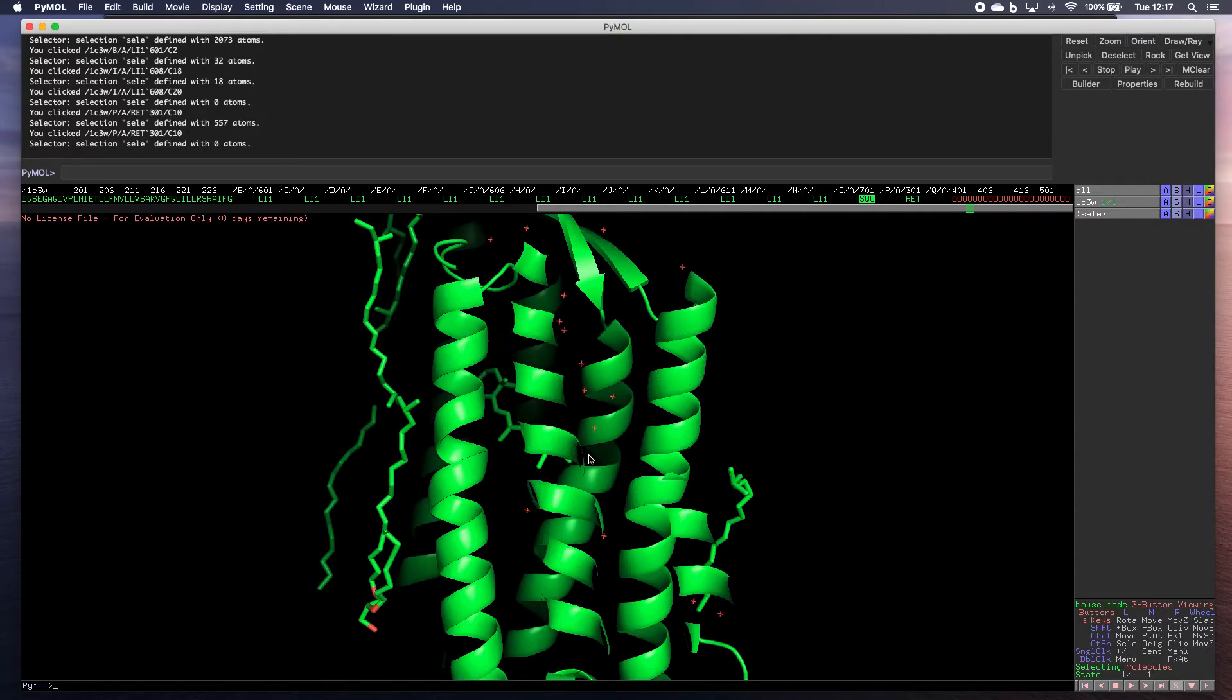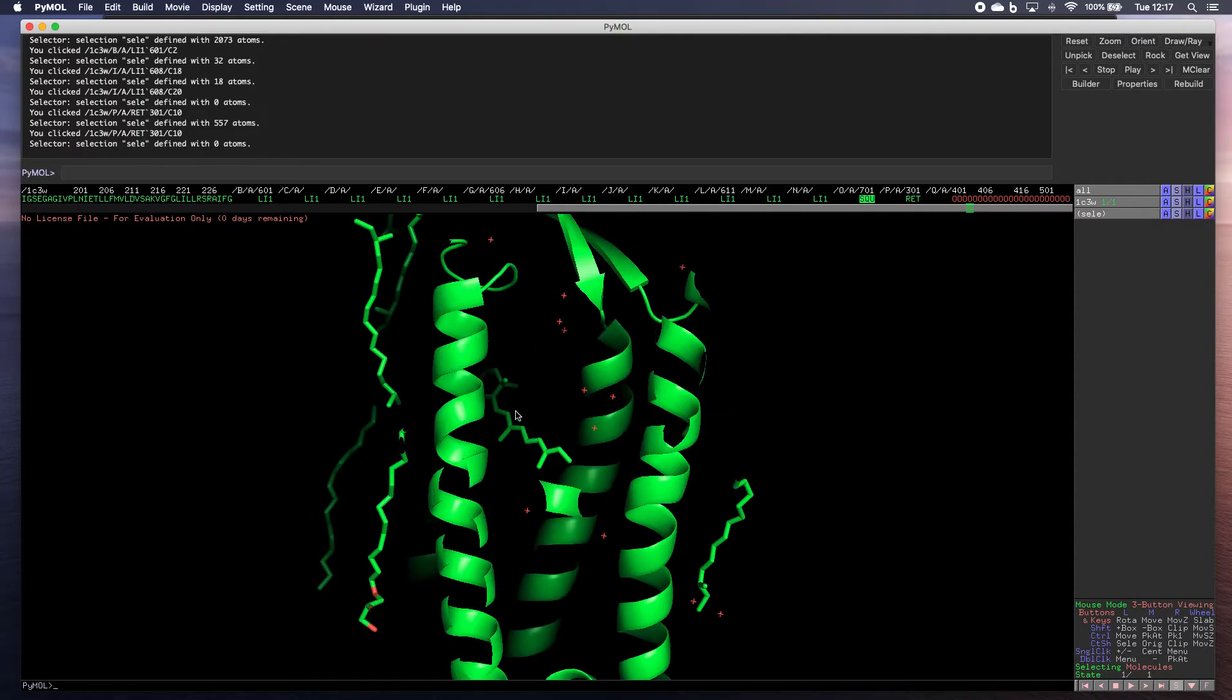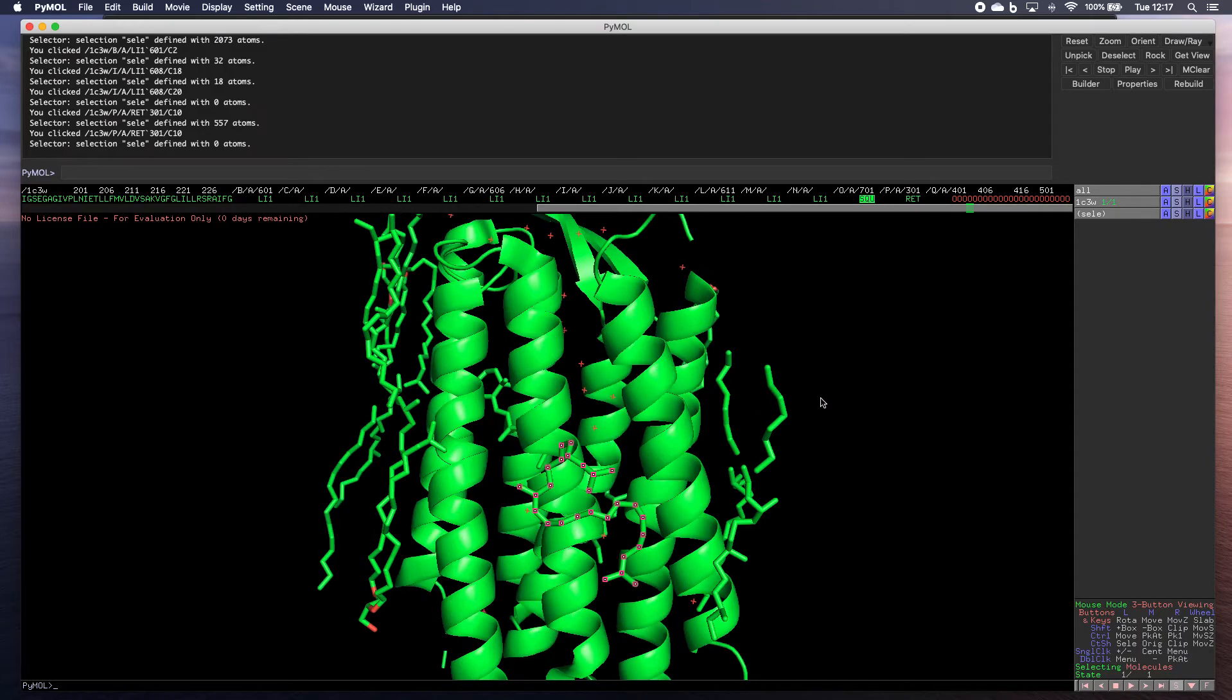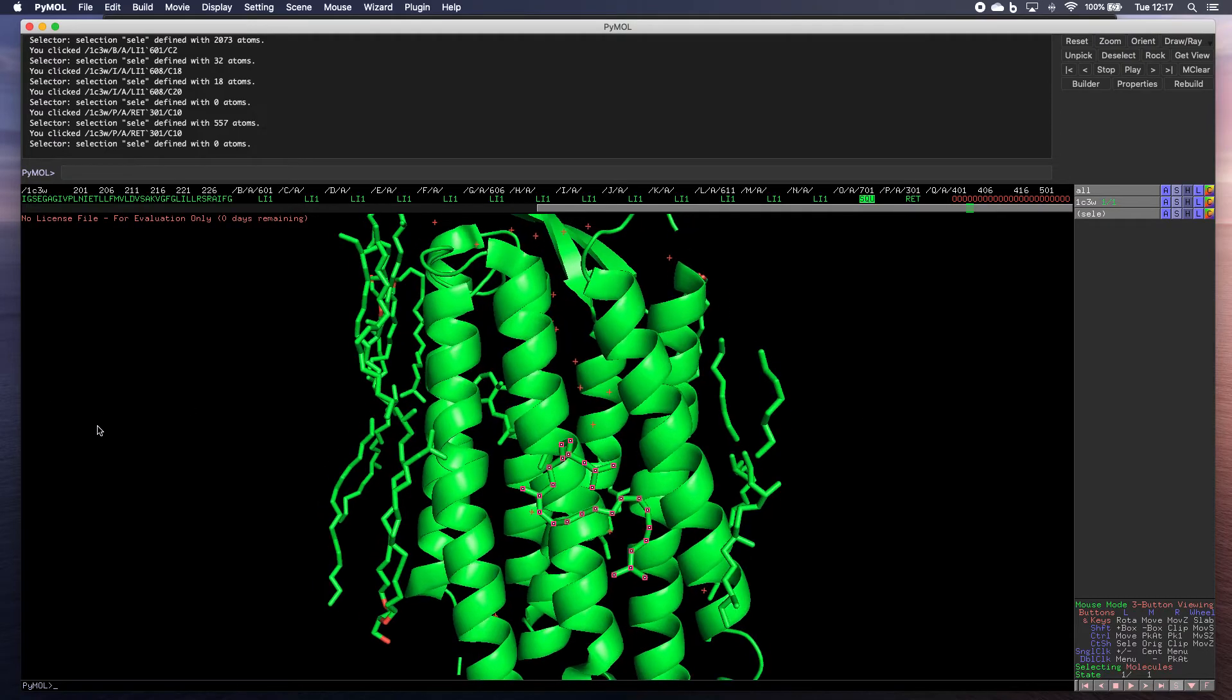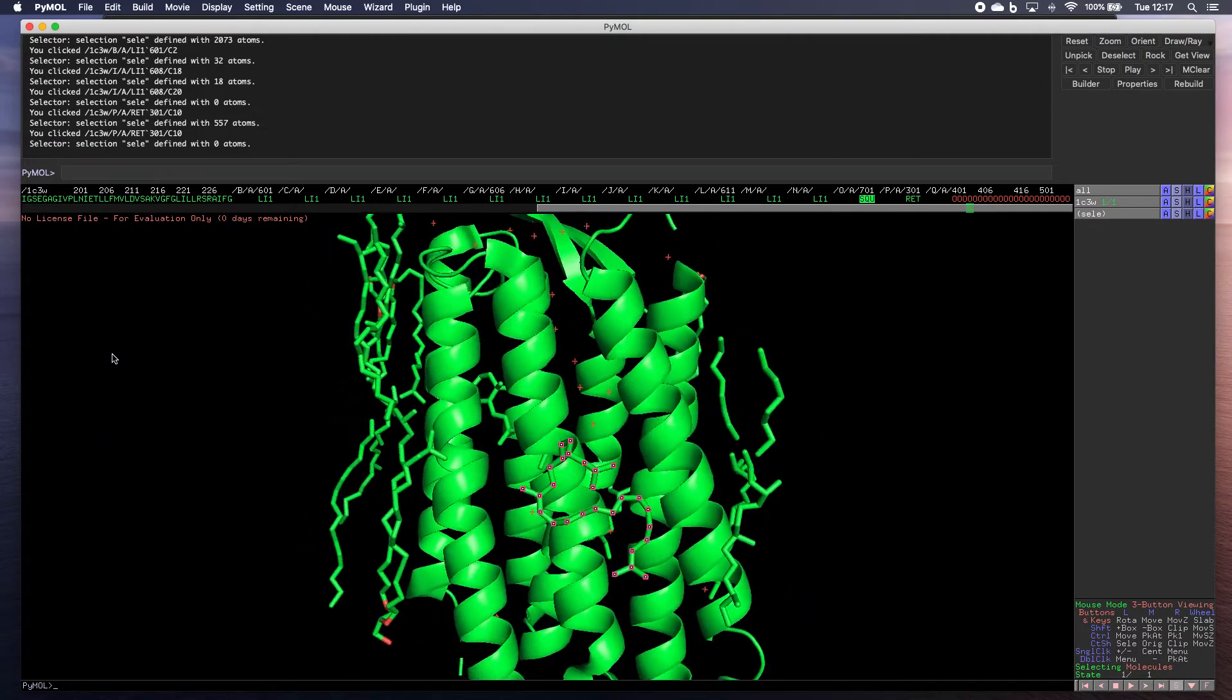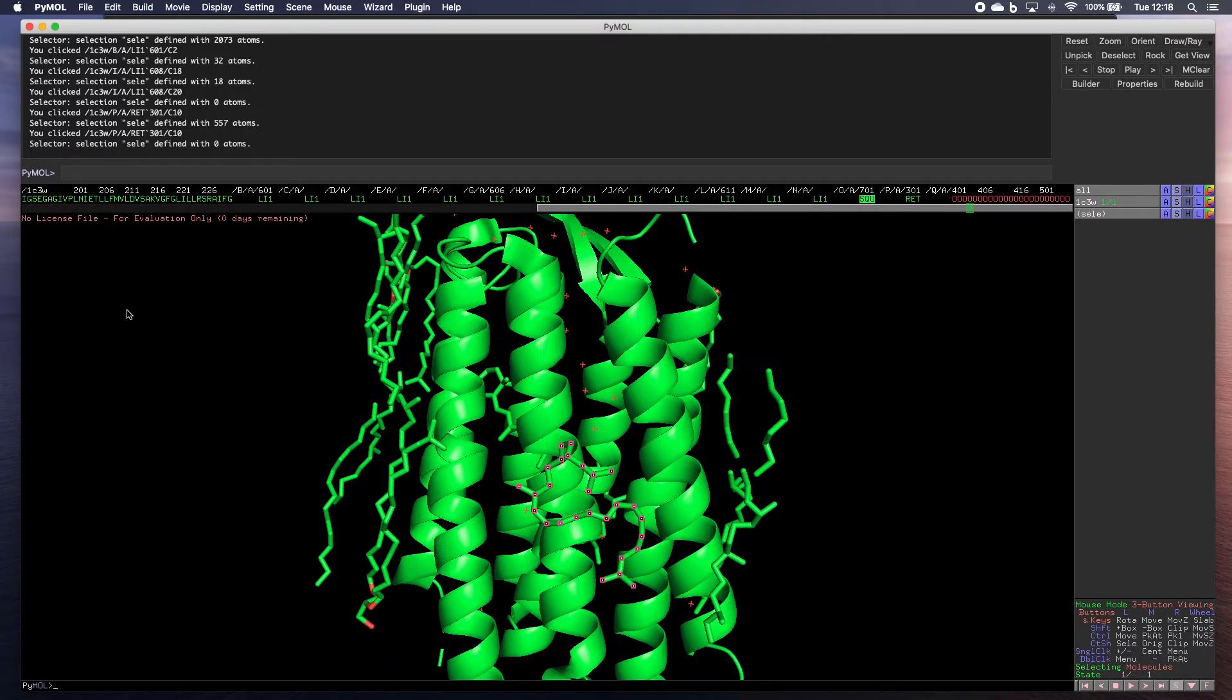So for example, if we just want to look at this molecule here, there we go. Now you can also, if you click to the right or left of the image, you can twist it as well and use the left mouse button to twist. So those are the main controls.